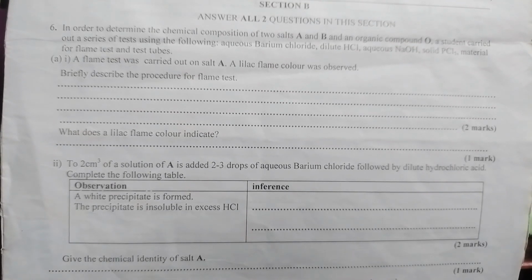And when you see sodium hydroxide or aqueous ammonia, they are testing for the iron 2+ and the iron 3+ ion. The iron 2+ produces a dirty green gelatinous precipitate, while iron 3+ produces a rust or reddish brown gelatinous precipitate. Nitrate will give a brown ring at the center of the test tube with ferrous sulfate.